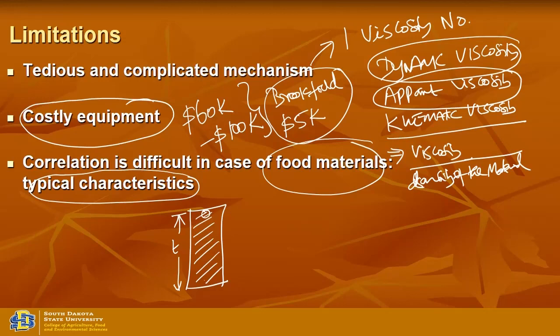The classical example is doing the compression test, because the elastic properties we can measure, but we can only theoretically compute the viscous properties of solid materials. Then we looked at the dynamic test, where we looked at the complex modulus, elastic and viscous modulus, and the importance of those measurements in the product development area.